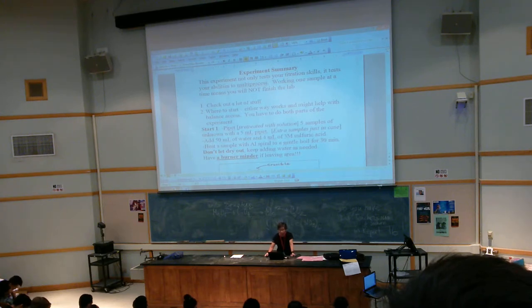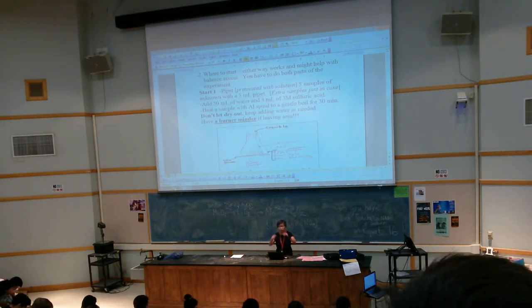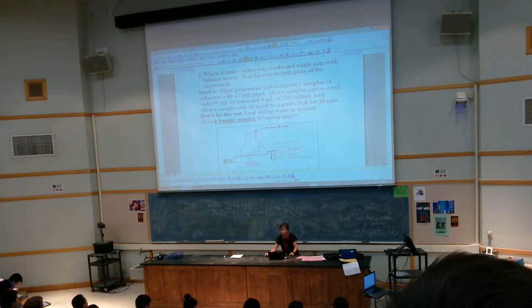Then you're going to add aluminum spirals to a gentle boil. One of the things you'll be checking out is this aluminum wire. You're going to coil it, and then you're going to put it in the solution. This is your solution. My drawing is very bad. But you're going to put a crucible, the porcelain crucible, on top, okay, to wedge the coil. You're going to put a loop on this coil so it doesn't fall in, but you want to fish it out after you're done cooking. You got it?